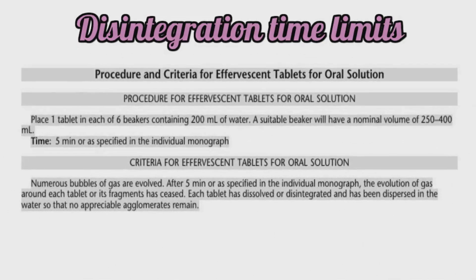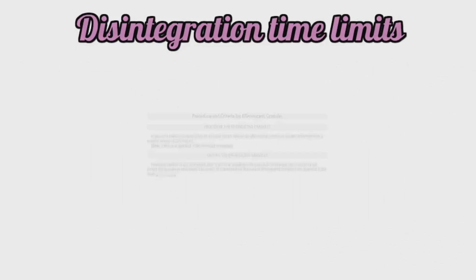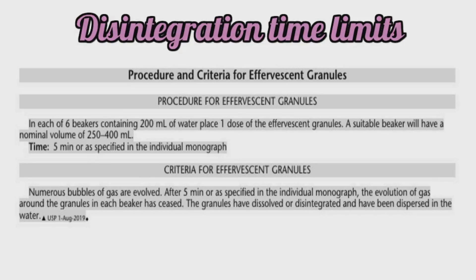The third type are effervescent tablets for oral solution. We place one tablet in each of six beakers containing 200 ml of water and wait for five minutes. After five minutes, the evolution of gas around each tablet or its fragments has ceased, and each tablet has dissolved or disintegrated and dispersed in the water so that no appreciable agglomerates remain — if so, the test passes. The fourth type are effervescent granules. We take six beakers filled with 200 ml of water each, place one dose of effervescent granules in each beaker, and wait for five minutes. After five minutes, the evolution of gas has ceased and the granules have dissolved or disintegrated completely.